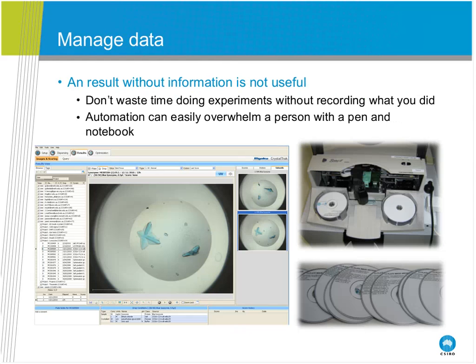And then the data stuff, well, how do we manage data? We have to be particularly careful because we are dealing with 150 different users. What we did is we borrowed an idea from James Holton, which is from a synchrotron. A synchrotron has this same idea. They generate a lot of data, but it's not really their data. And they manage that by burning DVDs, and we do the same thing. So we have a database where you can see the information about the experiments as they're set up, and you can come in, look at your images, see what was in the experiment at the time, and then annotate it as you want.